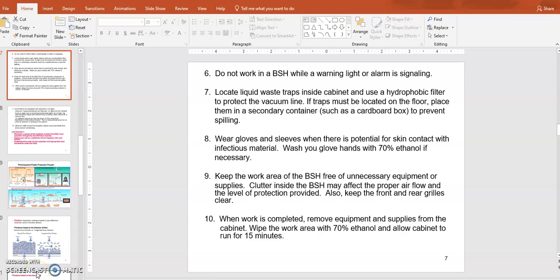Another important thing when you use a biosafety hood is disposing waste material. You have to have some kind of trap or waste container inside the hood, so while you're using the clean workspace you're not going to contaminate your material. If you're using a lot of liquid waste, it may be better to use some kind of filter that will trap your liquid waste so you don't make any splashes. Make sure you use some kind of disposal waste container in your workspace.